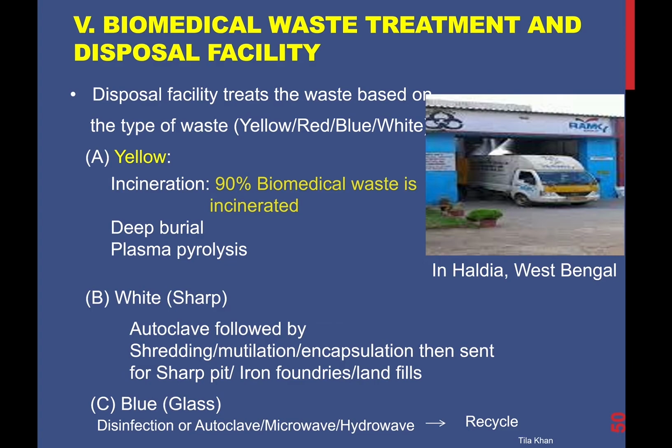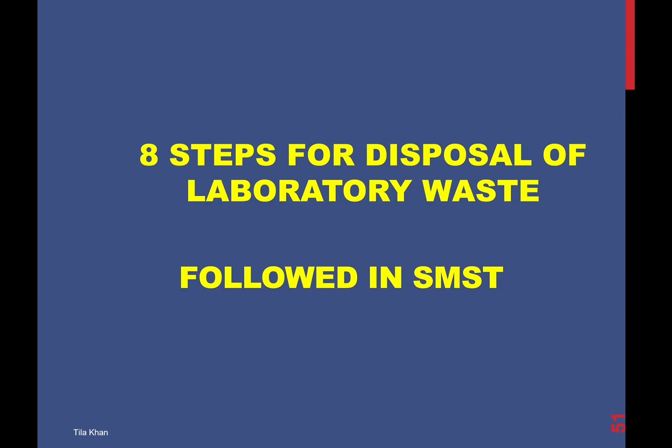The blue waste, that is glass waste. The glass waste is disinfected, autoclaved, microwaved, or hydrowaved, and then it is recycled. Now I will go over the 8 steps for disposal of laboratory waste that are followed in SMST.